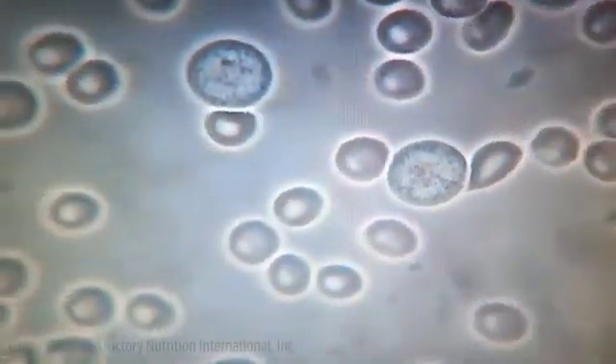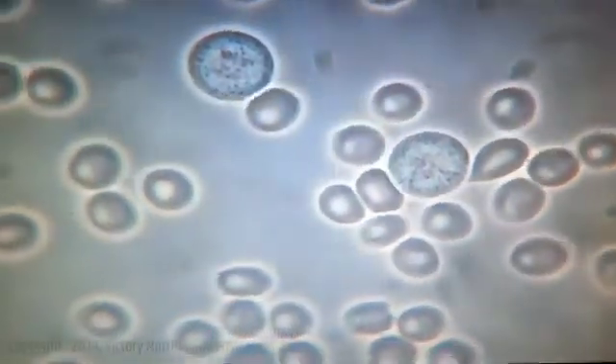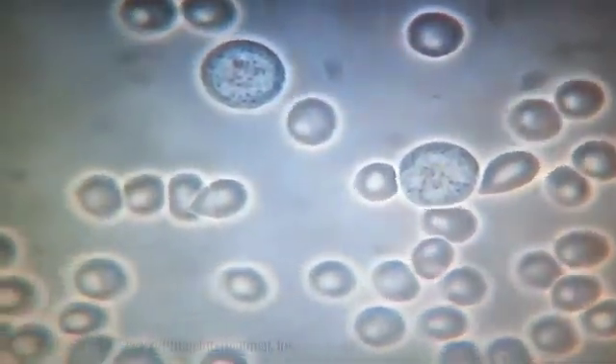The red blood cells are very loose and free-flowing. There are two neutrophils — one in the top left corner, one in the bottom right corner — and you can see that the neutrophils are four times bigger. It's only been five minutes.